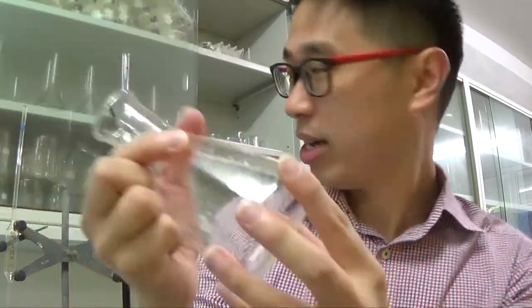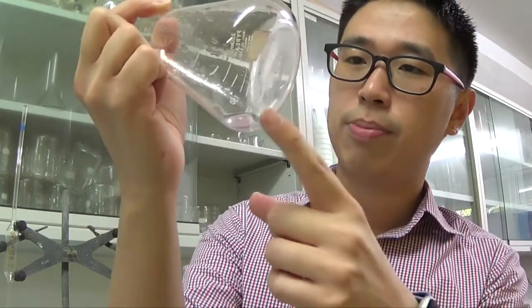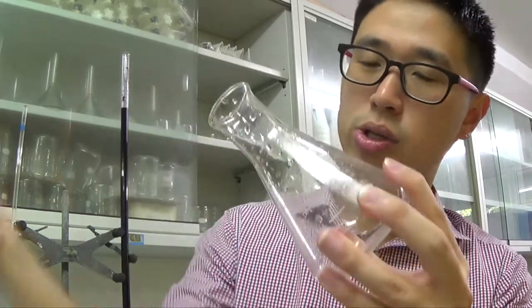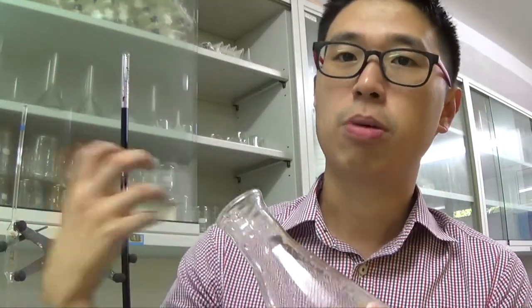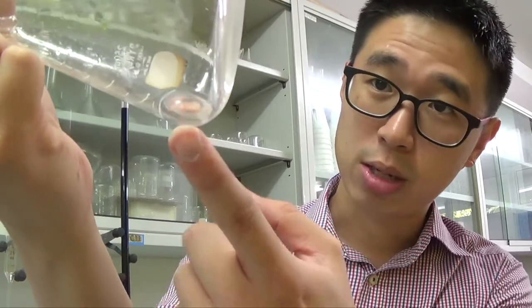Will it affect the end point? When you think about it, if you have a little bit of water in here, yes, it will affect the concentration of the resulting solution that you prepared in, but whatever you prepared in is a fixed volume of a fixed concentration. So if you take in 25 cm cube of a particular concentration, when you put it in, the mole is going to be the same whether you put it into a dry conical flask or whether you put it into a slightly washed conical flask with a little bit of distilled water.